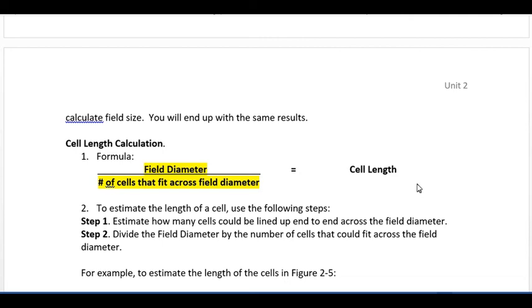Another tip is to have an idea of the average bacterial cell size, maybe a bacillus-shaped cell versus a spirillum versus a cocci, so that you can compare and see what answers you're getting. If you're getting 1,000 micrometers instead of 1 to 2 micrometers, something's off in your calculation. It may just be a matter of not using the correct units. So always have in the back of your mind where you should be, so that when you go through those calculations, you see if you fall into that range.